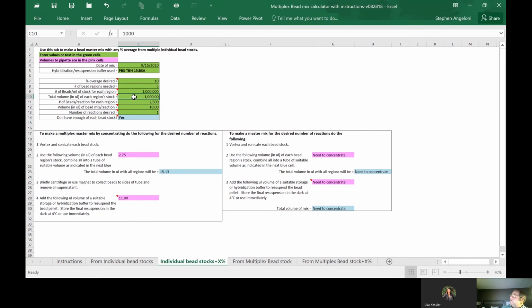And now let's say of all those bead preparations, the one that has the smallest volume is maybe 1 ml. Because some of those bead stocks, like we saw in the previous spreadsheet, if you decide you want to use the whole bead stock and dilute it to 1 million per ml, some of them will have a different volume. Out of those different groups of coupled beads, there may be one that, instead of 1 ml total, has only, say, 900 microliters.